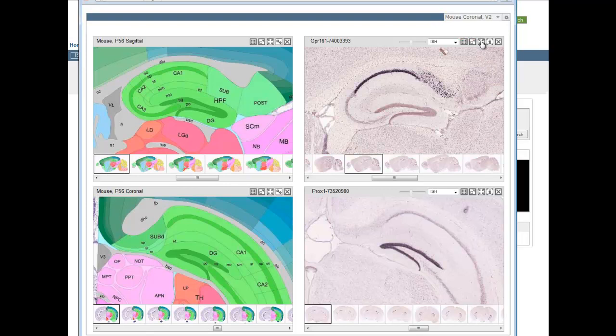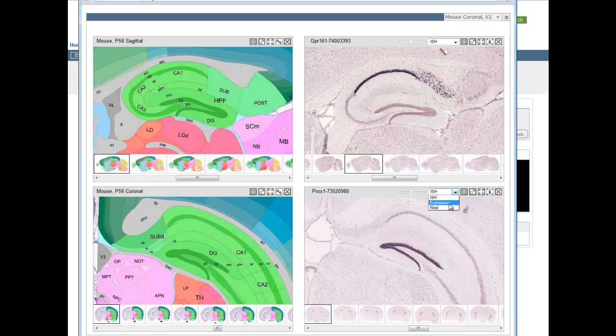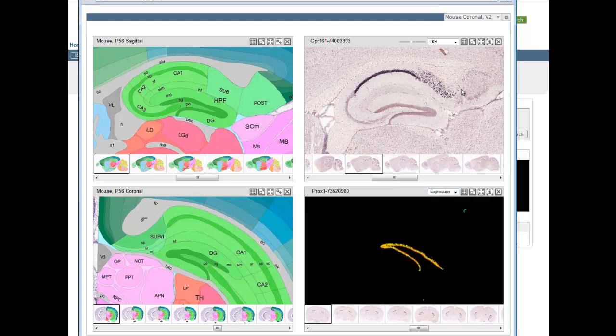By having included the reference atlases, you can see that GPR 161 is expressed selectively in area CA1 and the subiculum of the hippocampus. PROX1 expression doesn't show as obvious a pattern, and utilizing the Expression Mask feature again, shows that selective yet lighter expression resides in the dentate gyrus.